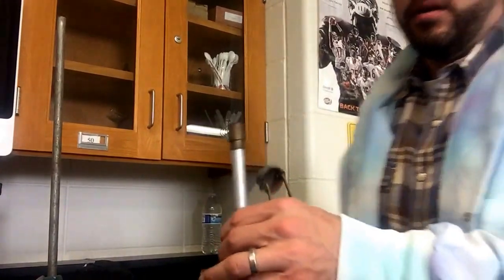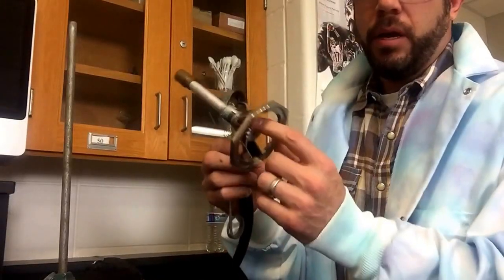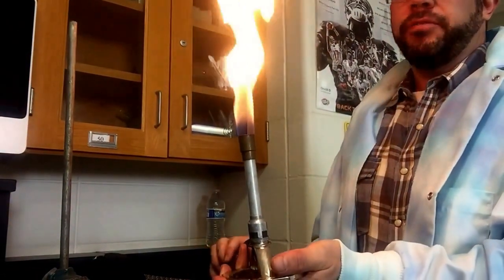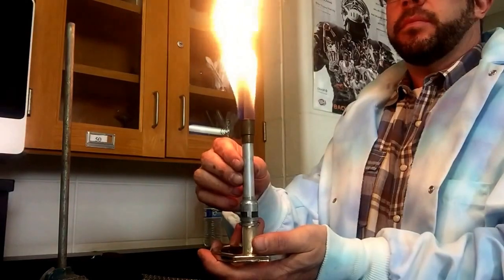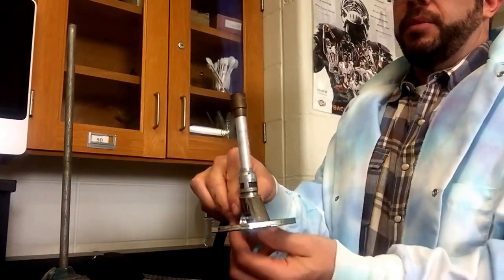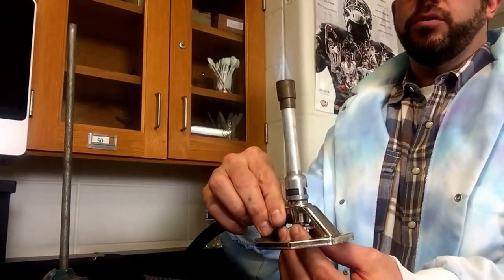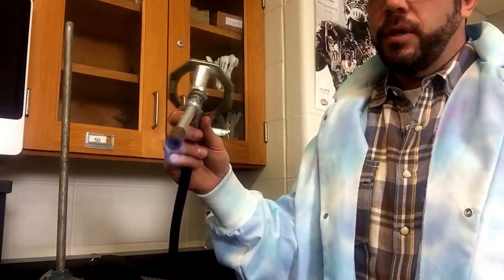I've got my Bunsen burner right here. I'm going to light it — turn the gas on, watch long hair and sleeves. If you don't hear the gas come out, it's probably because the bottom is closed, so just open that up. This is a pretty high yellow flame, so we want to make it smaller and get a small blue cone. Do we want more oxygen in there or less? The answer is more. So I'm going to open up the barrel on the Bunsen burner and you'll see it change to a blue flame. I'm going to get a smaller flame by closing the bottom. It's a nice blue flame — I can turn it at an angle and put it in here to help get that silver I'm looking for.